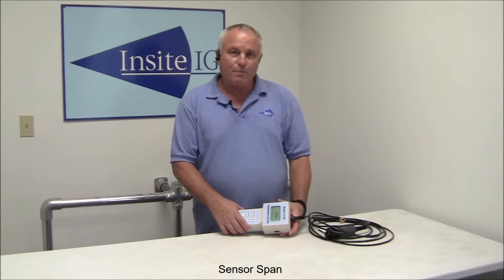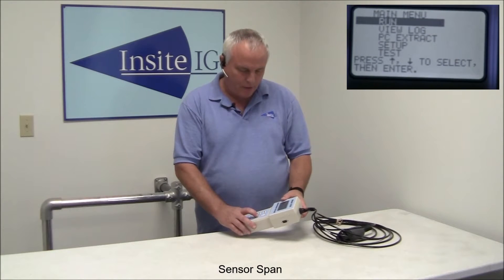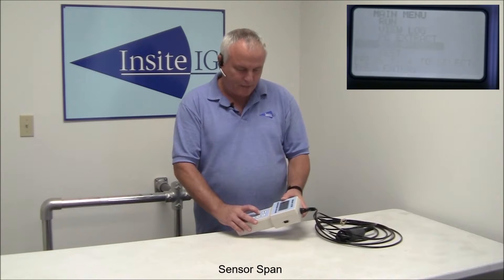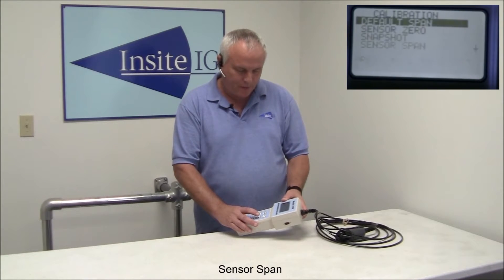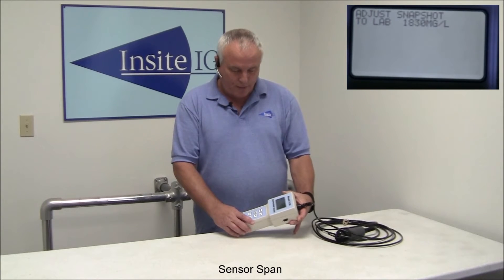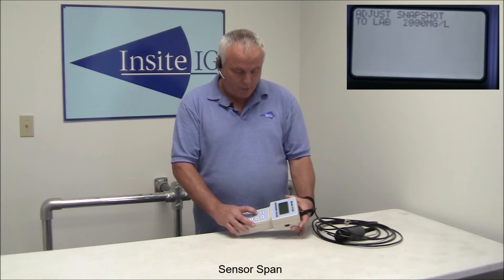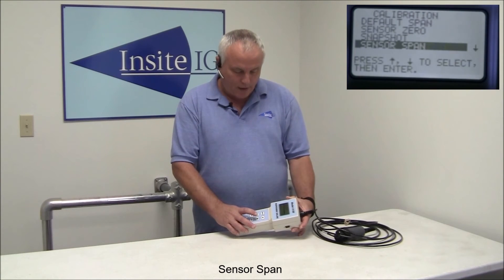The final step in doing the calibration is to do the sensor span. Once you've gotten your lab results back from the sample we took earlier when we did the snapshot, go to the unit, turn it on, press menu, scroll down to setup, press enter, scroll down to calibration, press enter, scroll down to sensor span, press enter. It's going to come up with the number that it thought it was when you took the snapshot. All you have to do at this point is use the up and down arrow keys to make it agree with the result that the lab came back with. Move it up and down until it gets to where it needs to be, press enter, and it'll say storing.